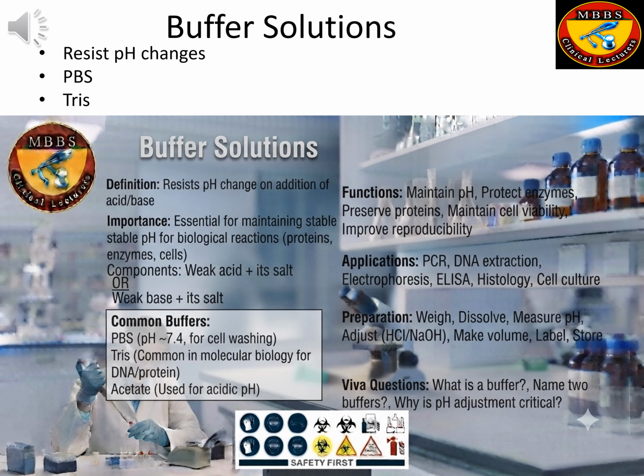Improve experimental reproducibility. Applications. Buffers are used in PCR. DNA extraction. Protein electrophoresis. ELISA. Histology. Cell culture. Biochemistry. Factors affecting buffer efficiency. Temperature. Concentration. Buffer capacity. Correct pH adjustment.